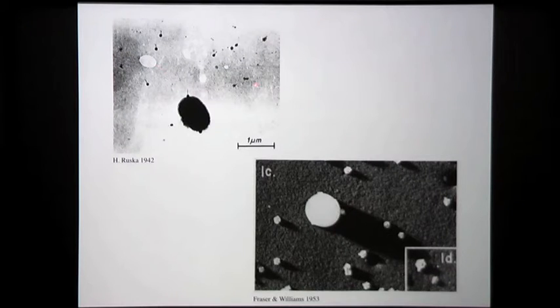And this picture is taken from that document. So, this really is about the stage that the bacterial pictures that I just showed you with the von Leeuwenhoek microscope is at. You can see there's something there. You can see a bit about its shape.